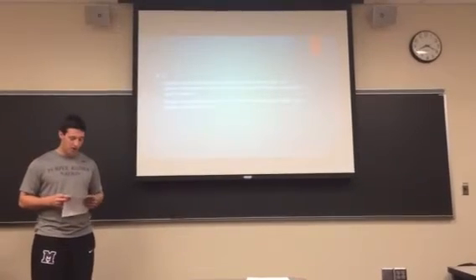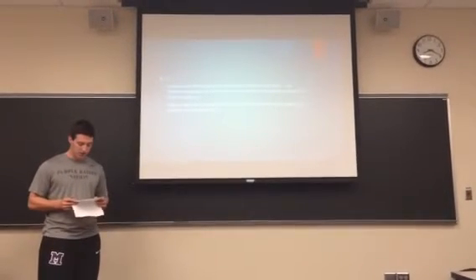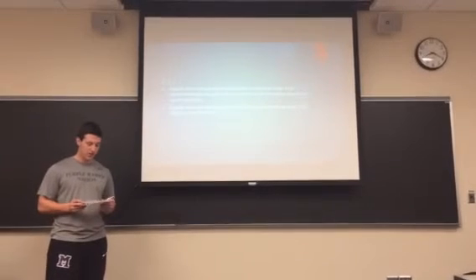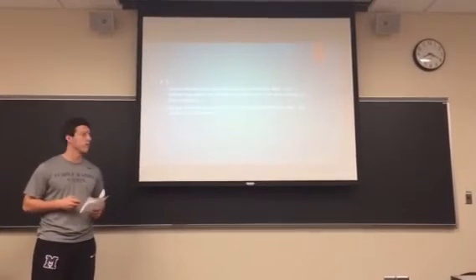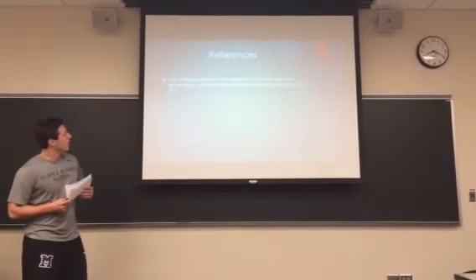In that, I said trial 5 turned out to have similar average values to 1 through 3 because the concentration of HCl and NaOH was increased to 2.00 molar. These are my references.